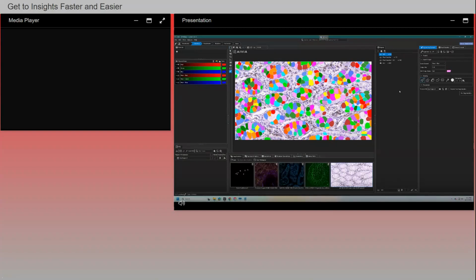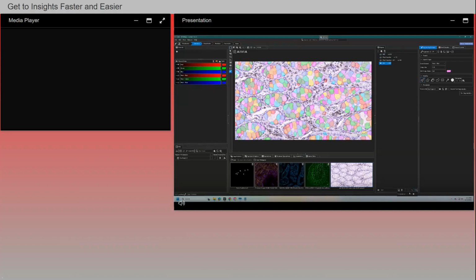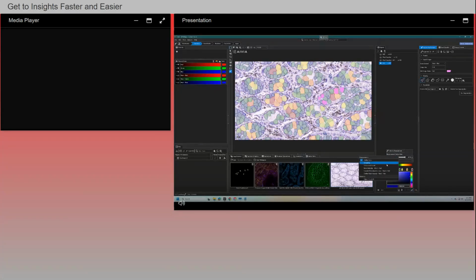So in this detected set of cells, you can adjust the transparency, as I showed you earlier, to appreciate the segmentation results. They look really good. Again, color by measurement based on, for example, circularity or any number of measurements that you choose to apply here.